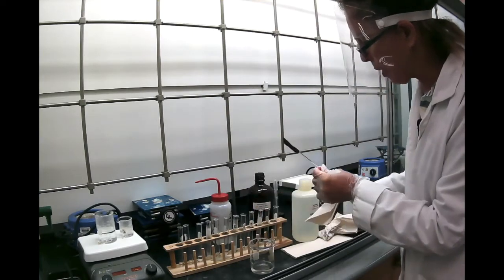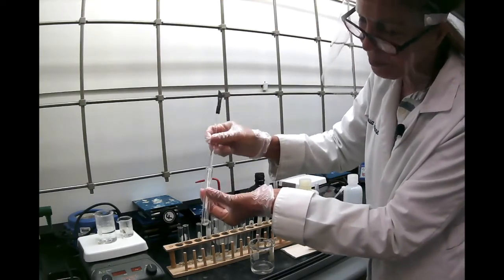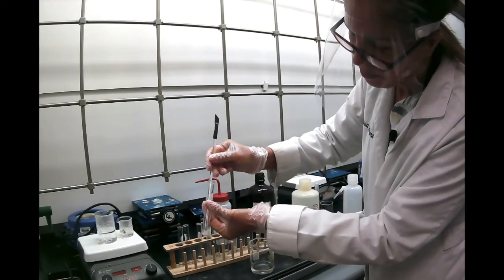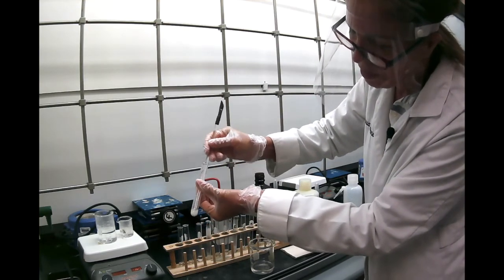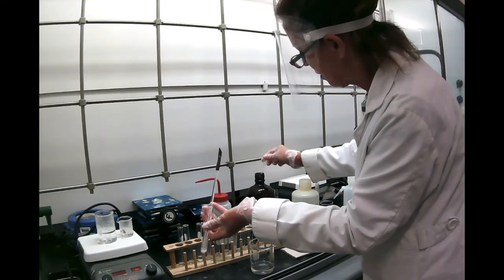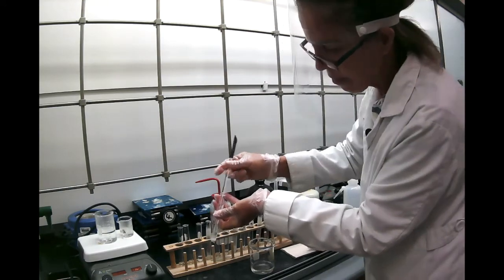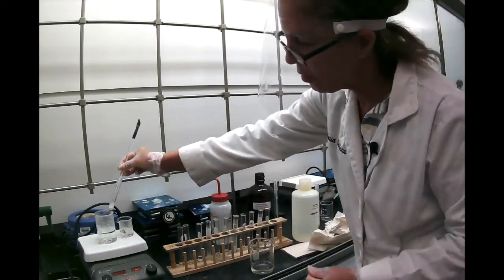Now the last one is acetanilide in petroleum ether. And of course, you see it's definitely not soluble. I'm going to add a tiny bit more. It's obviously not soluble.